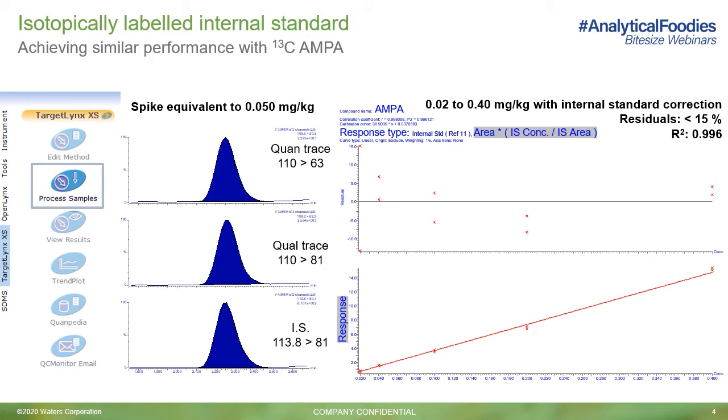Looking at the calibration series plotted on the right-hand side of the screen, the software is now incorporating the internal standard into the curve. Rather than only considering the analyte's peak area, as was done when plotting the matrix-matched curve, here the software is taking the known concentration of internal standard and its detected response into consideration. The exact information plotted on the y-axis is highlighted in grey.